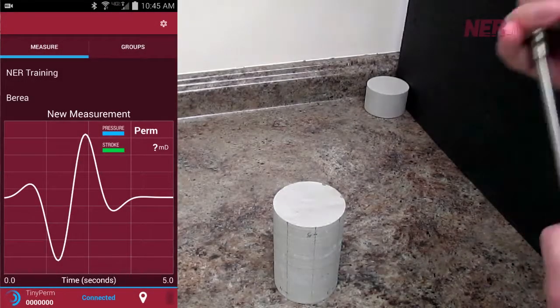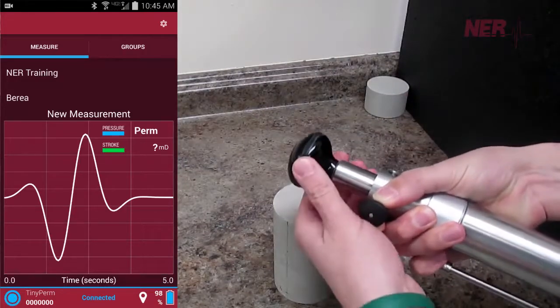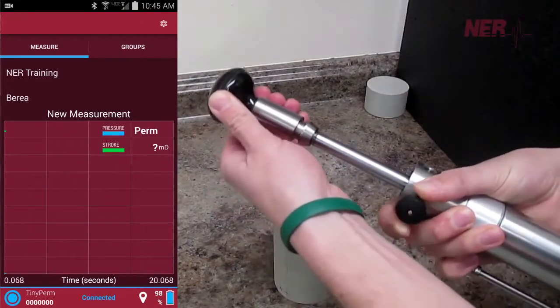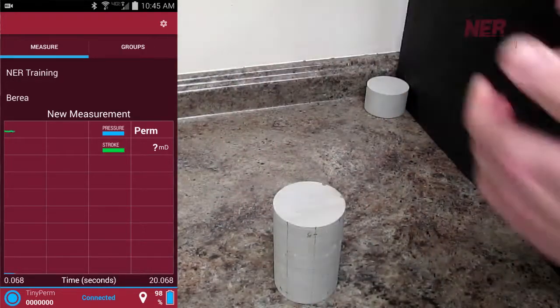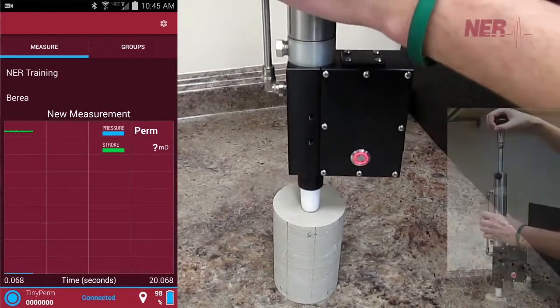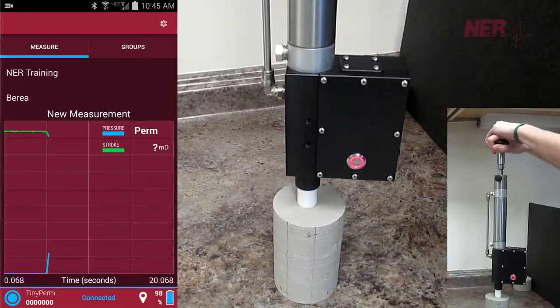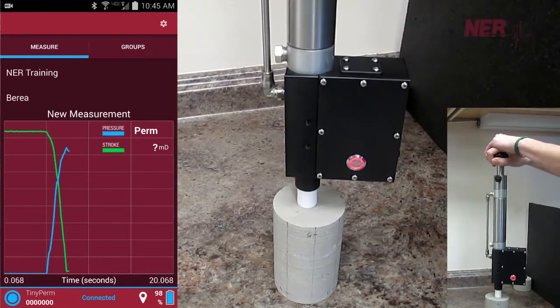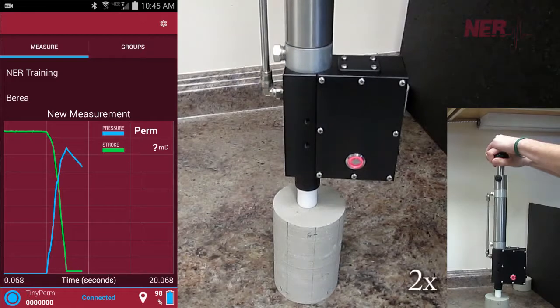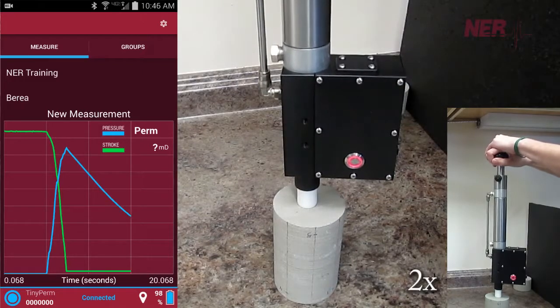To conduct a measurement, the operator presses a rubber nozzle against the specimen and withdraws air from it with a single stroke of the syringe. As air is pulled from the sample, a microcontroller unit simultaneously monitors the syringe volume and the transient vacuum pulse created at the sample surface.